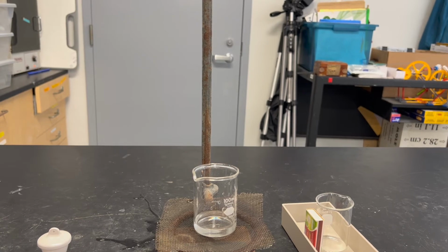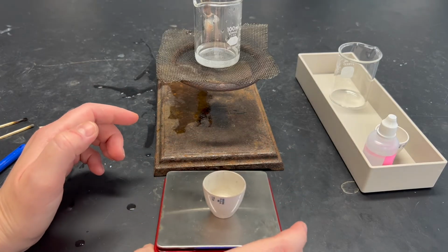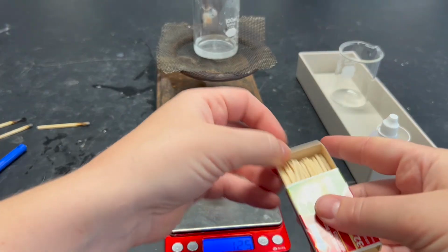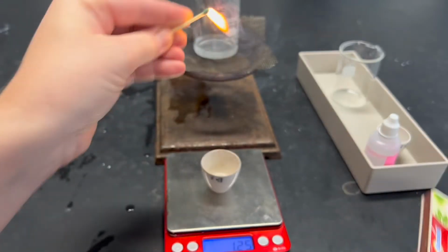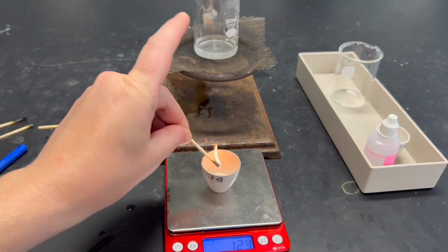Then it's time to light your ethanol on fire. Pull your scale off of the ring stand with the ethanol on it. Then, using your matches, light a match and light your ethanol on fire. Just hold it over it.